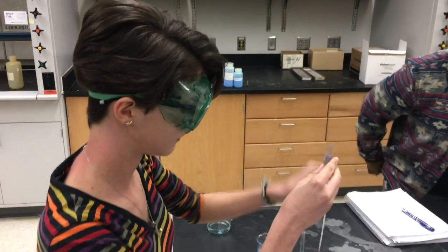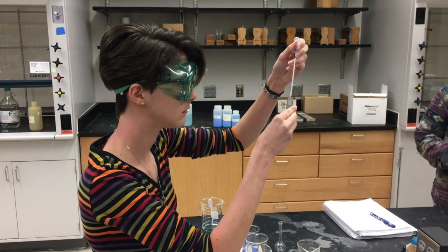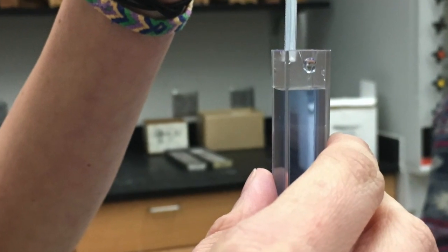Before using the spectrophotometer, it is important to fill each cuvette exactly to the line with your samples in order to get the best absorbance readings.